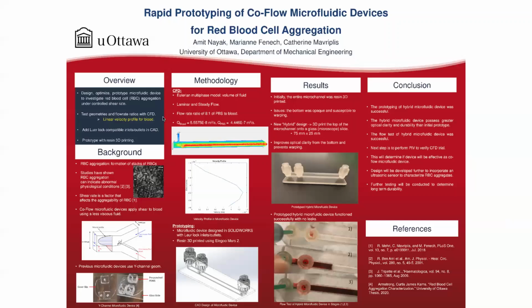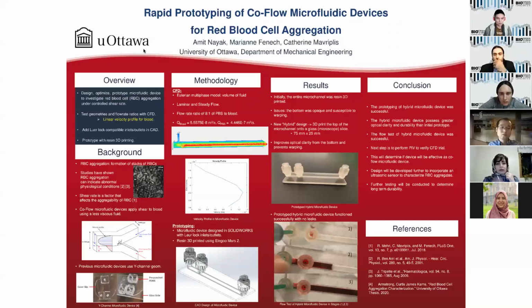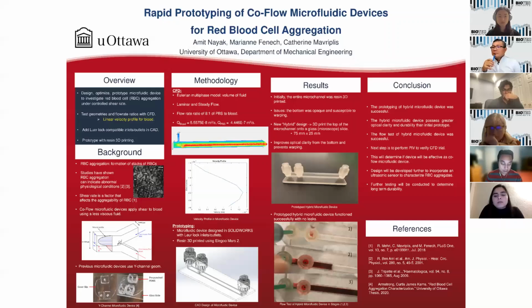So the next steps are actually to test and verify the results of the CFD trial using PIV on this microfluidic device. And in the future, we'd like to add an ultrasonic sensor to further characterize red blood cell aggregates. Thank you for listening to my presentation.